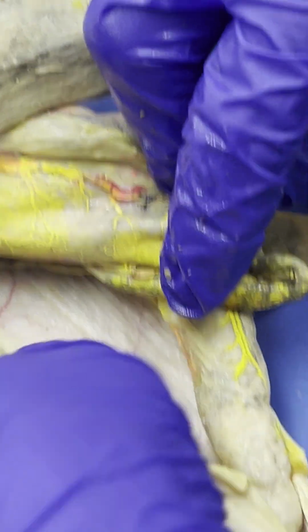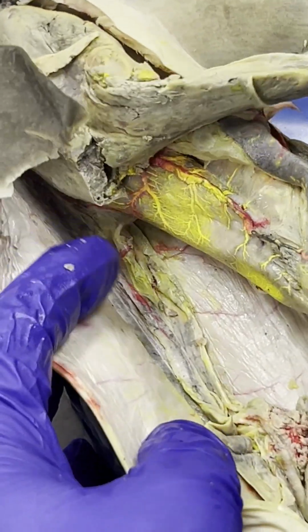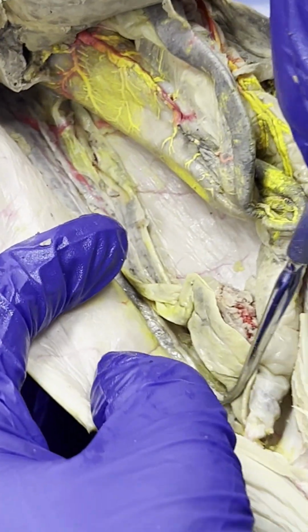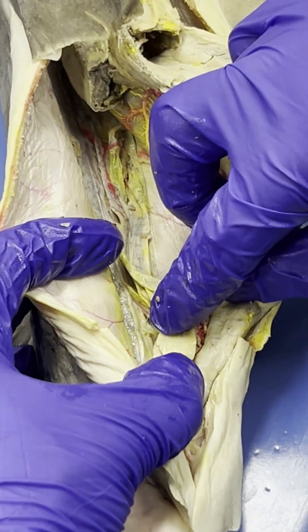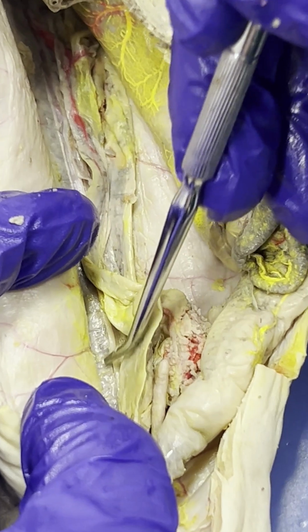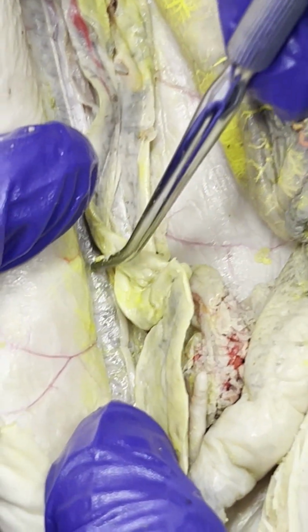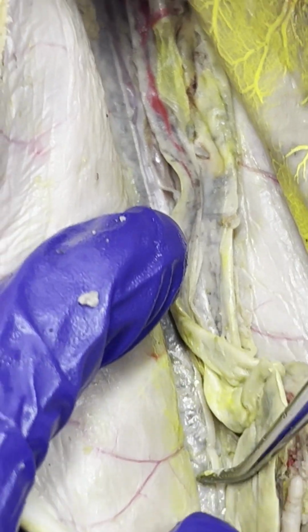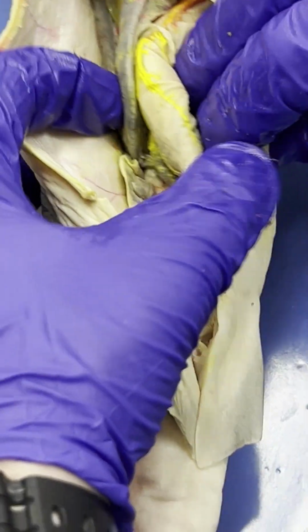And the last structure that I want you guys to learn before we move on to a different video is going to be the kidneys of the shark. Kidneys of the shark, they literally run up and down the entire body of the shark. So here's actually a good look at the kidneys, and you can kind of see like they're kind of pouchy. So I don't know if you guys could see those little pouches, but if we keep on going up, it'll run all the way up the shark for these kidneys. And I'll show you guys on the other side as well, because they have two kidneys, just like we do.